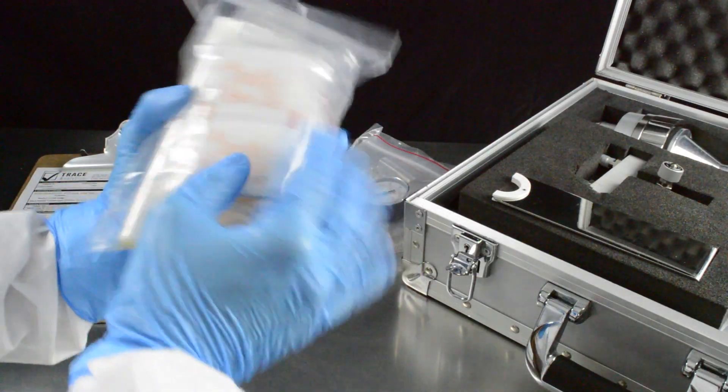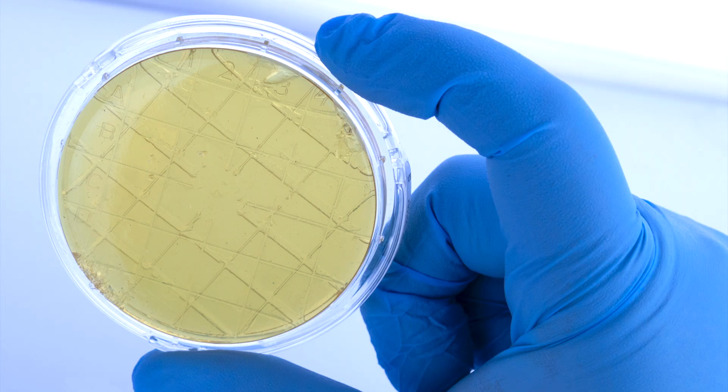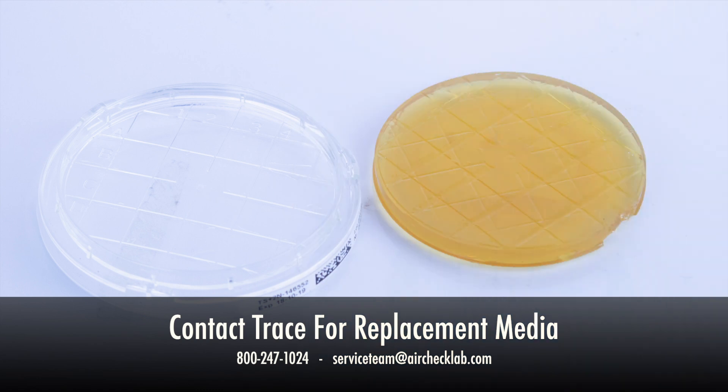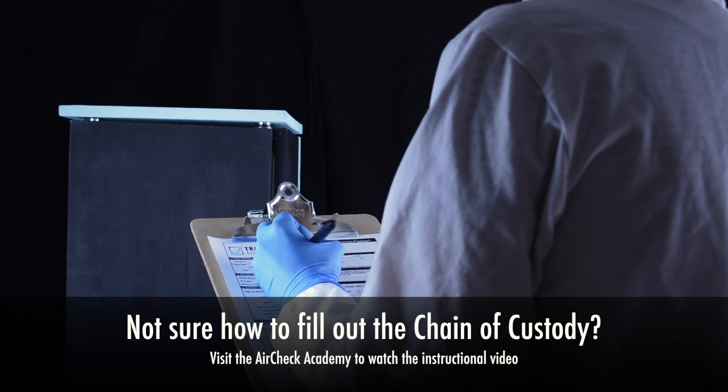Inspect the plates to make sure they are intact and undamaged. If there are any broken pieces, if the agar is melted, the grid is not aligned properly, or the agar is loose from the plate, contact Trace immediately for replacements. Review and complete sections 1 through 4 on the chain of custody.